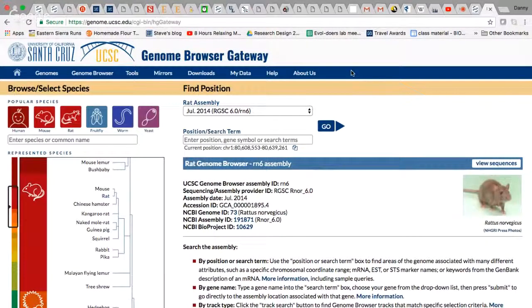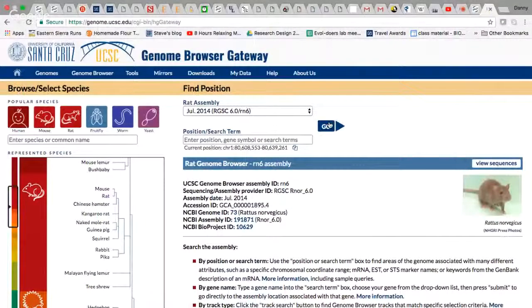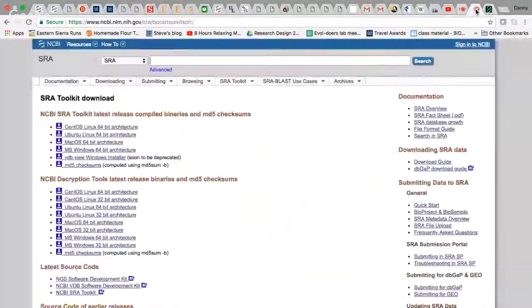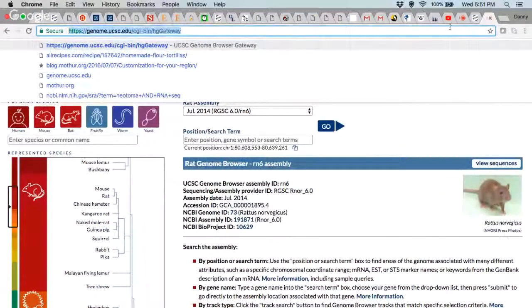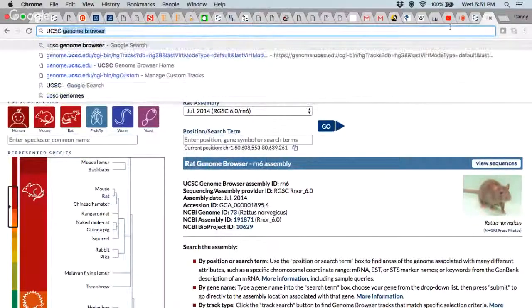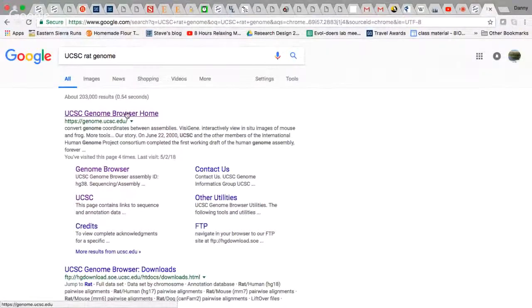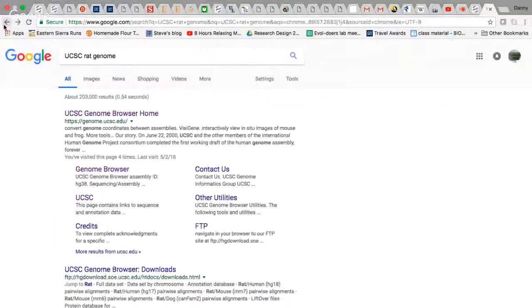Is that right? Let's see. Where did I get that?